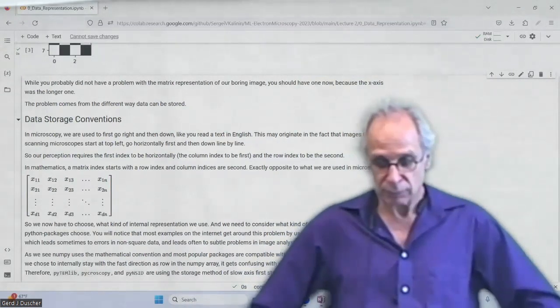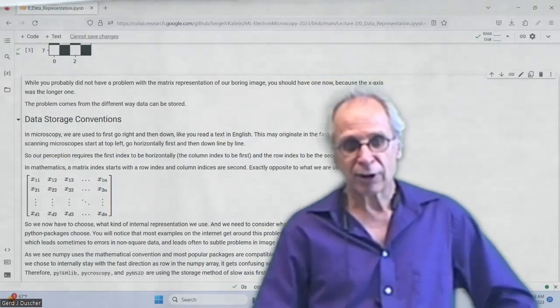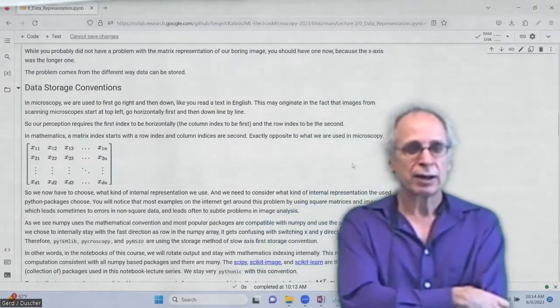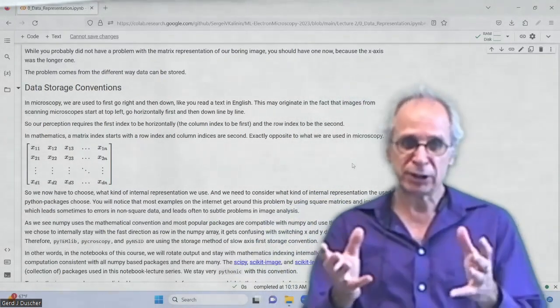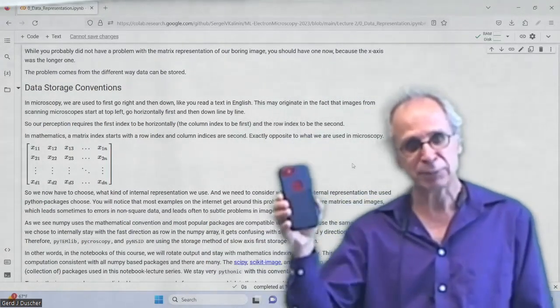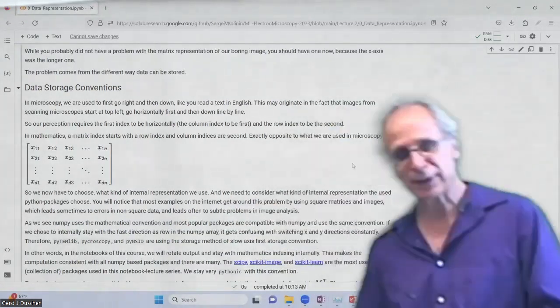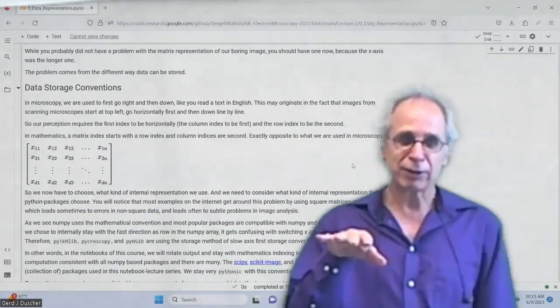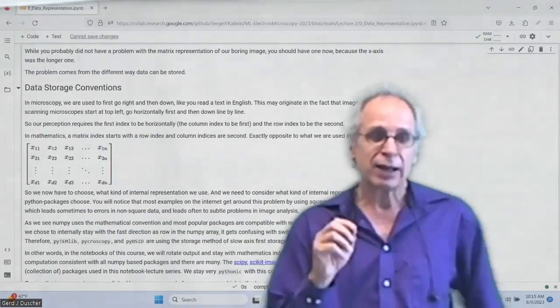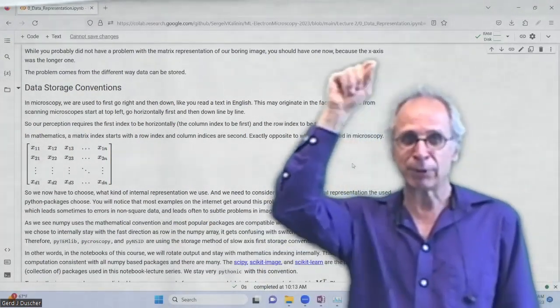The reason why that is important in STEM: if you have a normal image, take an image with your cell phone, who cares what is left and right? Independent of that, for normal scientific data, it doesn't make a difference. However, in STEM, it makes a difference. You start on the top left and you jump around.